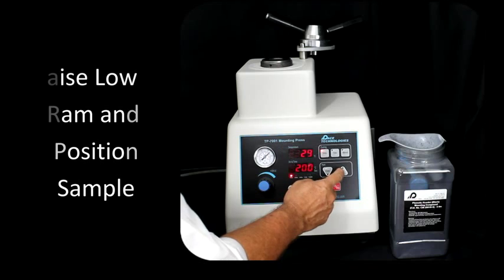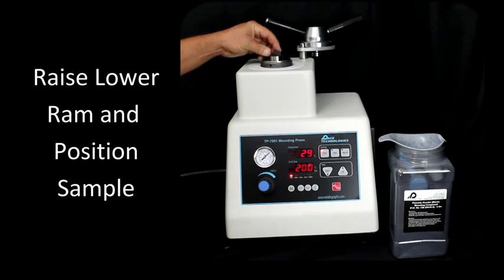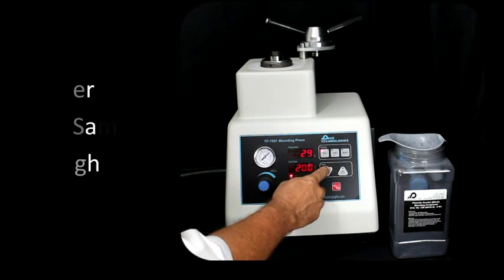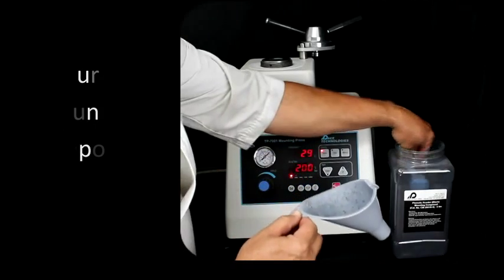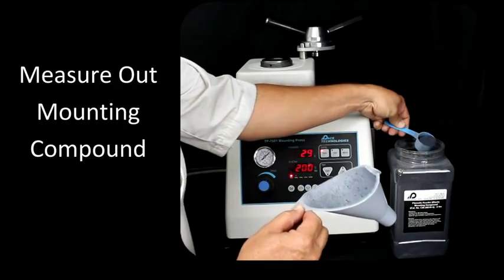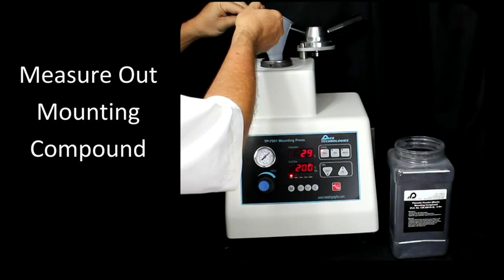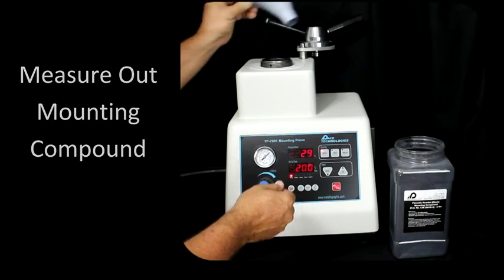The first step is to raise the ram, locate your sample, lower the ram slightly, and then measure out the mounting compound. Go ahead and pour that in.